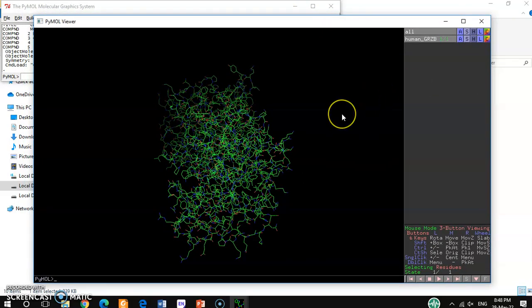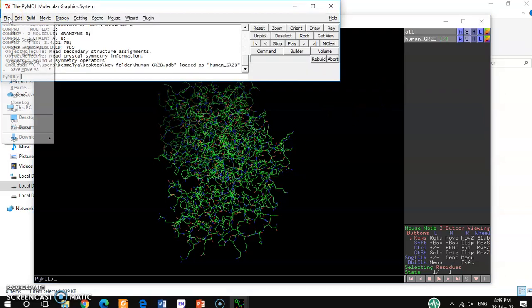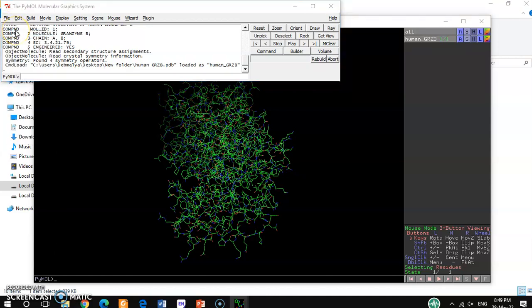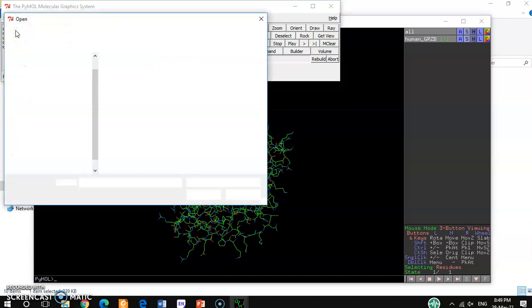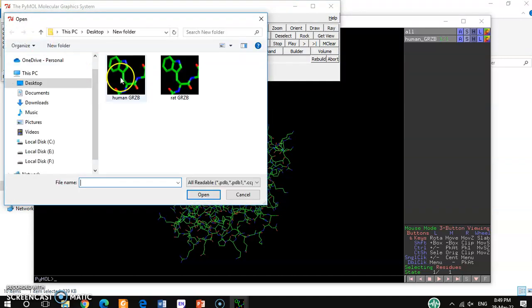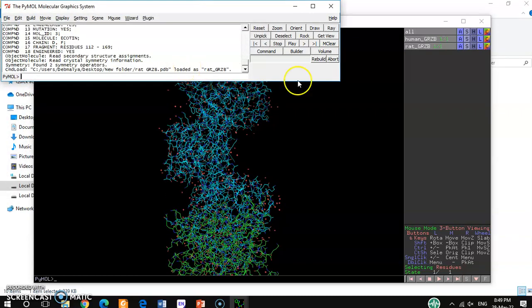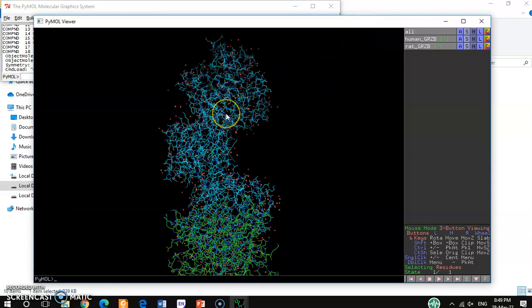This is the human granzyme B, and another structure that I want to align — I want to open that structure too, which is the rat granzyme B. You can see here the two structures are loaded: one is showing in green color and another one is in sky blue color.